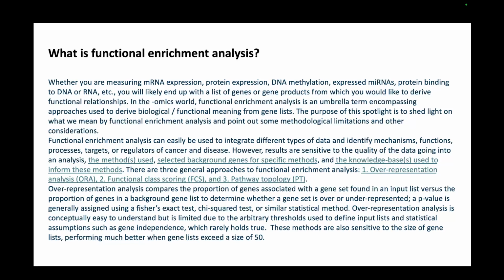So say you check for 5 pathways. For example, you are checking for the apoptosis pathway, and metabolic pathways like glycolysis, oxidative phosphorylation, fatty acid oxidation, and other types of pathways. And what you see is that 8 of the 10 genes that you have identified as differentially expressed are from a particular pathway.